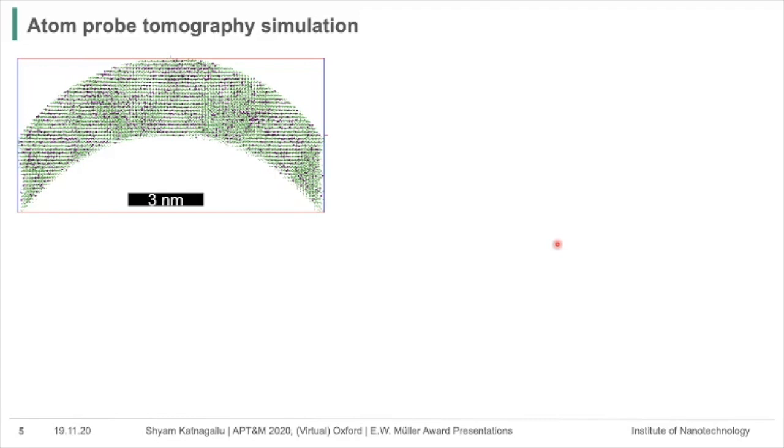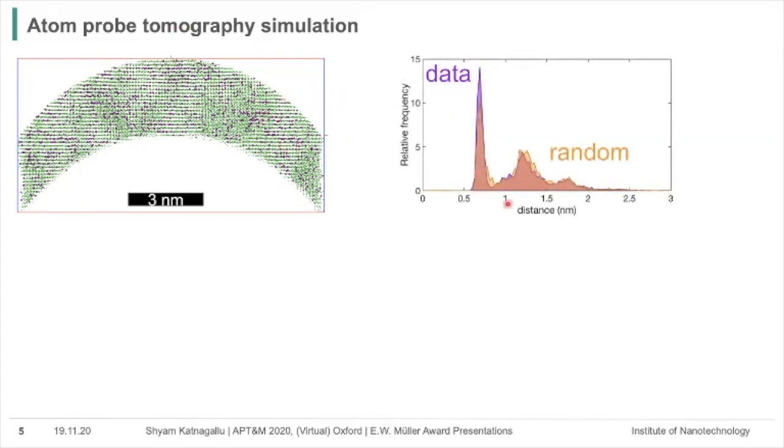So now that we have this deformed volume with rhenium segregated at defects, we cut out a tip from this deformed volume. To show that rhenium segregation is bimodal, we show a nearest neighbor distribution of rhenium. Here you can see that there is a rhenium segregation peak and there is a bulk random distribution peak. What we do next is use this tip and, using a model called the Robin-Rolland model, we do field evaporation of this tip.